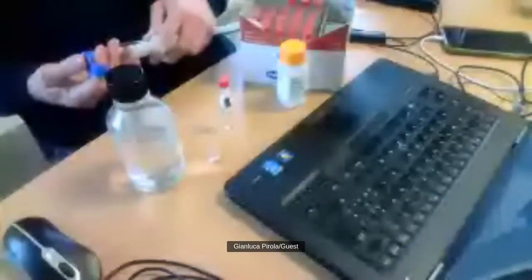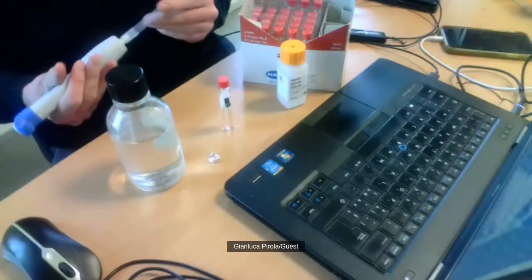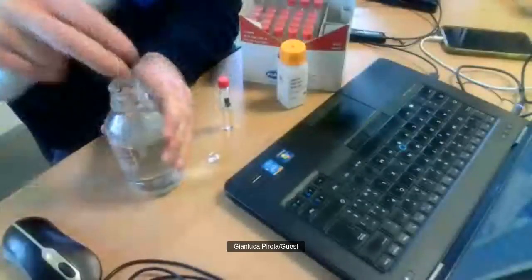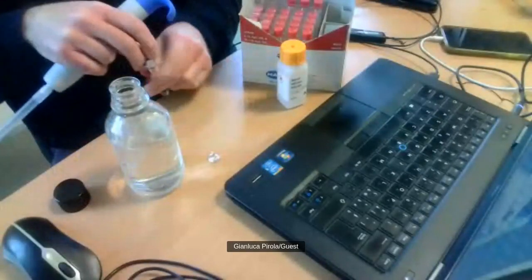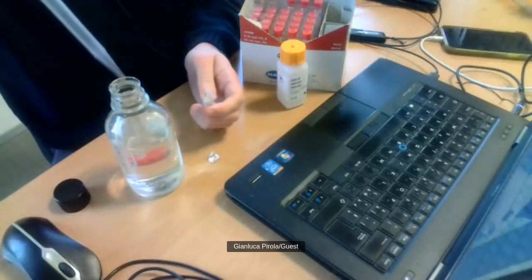So we have to change the volume, so you will discard the previous tip. Yes, I discarded it. Of course, you can reuse the tip if you use the same sample or the same reagent. But in case you change the sample or the reagent, you have to discard it because you can create interference. So each time you test, it is better to discard it and use a new tip.